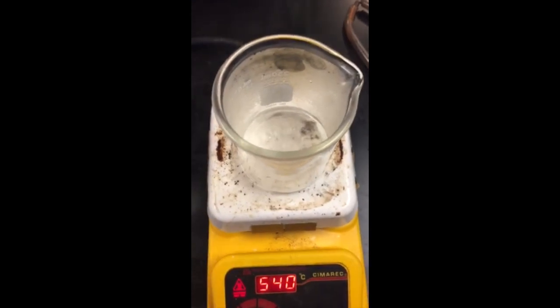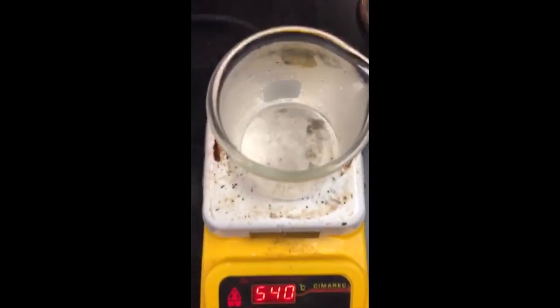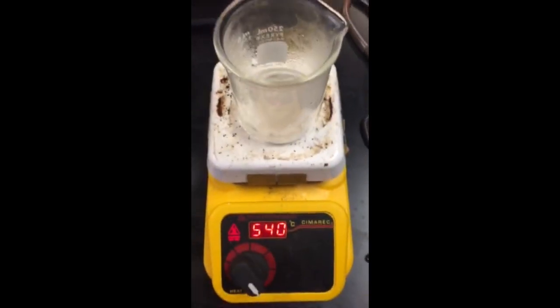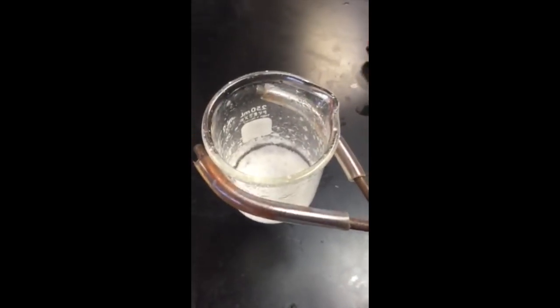Now what we are trying to achieve is the water evaporating and leaving us with the salt on the bottom of this beaker. Right now it's boiling and we just have to wait for the water to evaporate. The water evaporated and the salt is all left over. We're going to take it off the heat and wait for it to cool down.